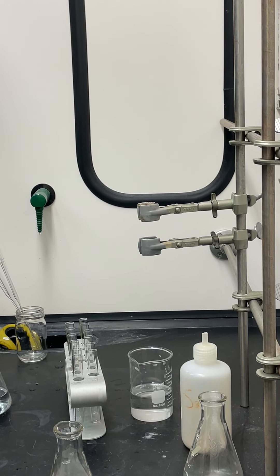Based on the TLC ratio we discovered today, we'll use a 6 to 1 ratio of hexane to ethyl acetate as the solvent system for the column. Instructions will be sent out.